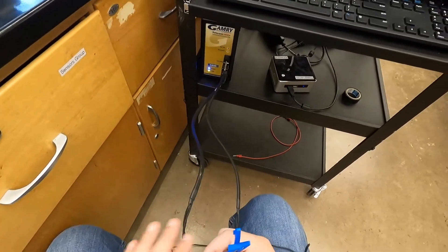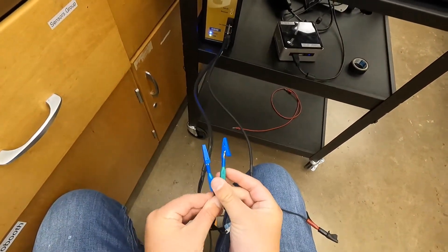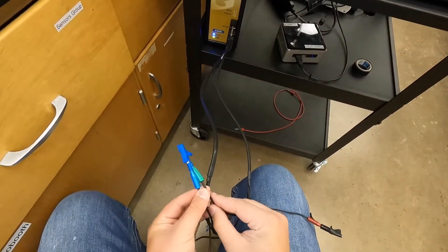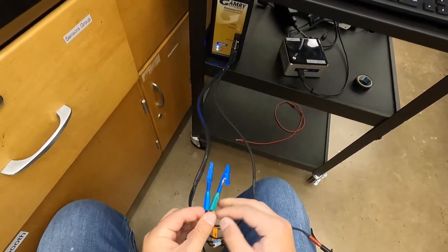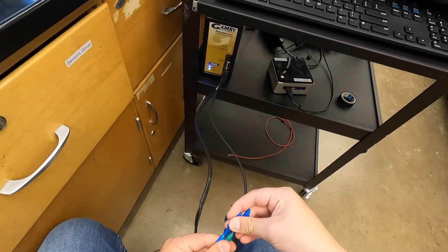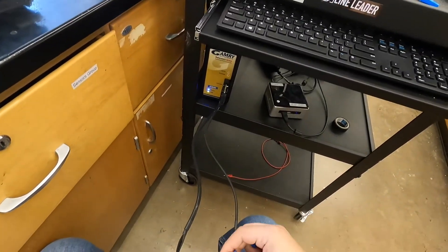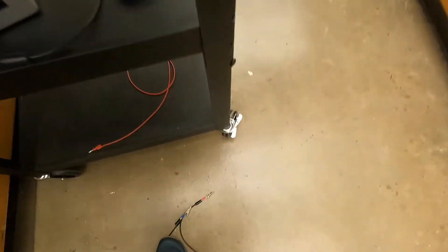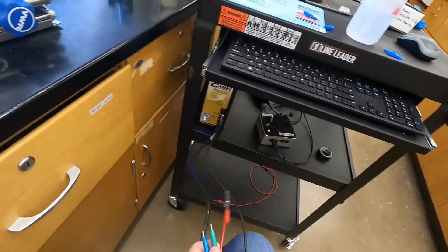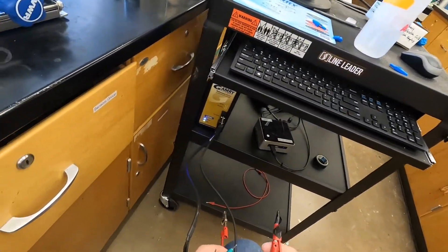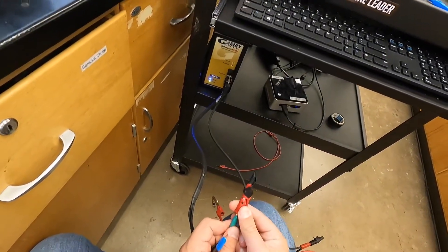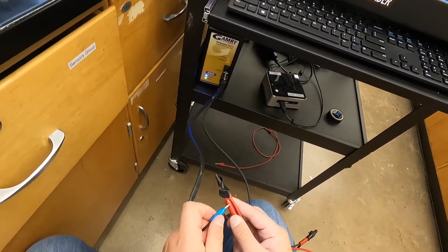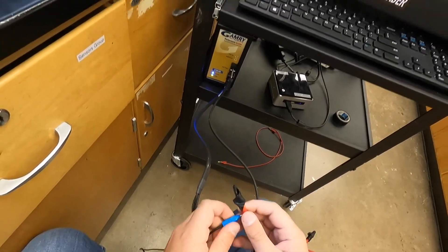And then last, we're going to short our working and working sense electrodes together. Grab the red cable and plug both of those into that connector.